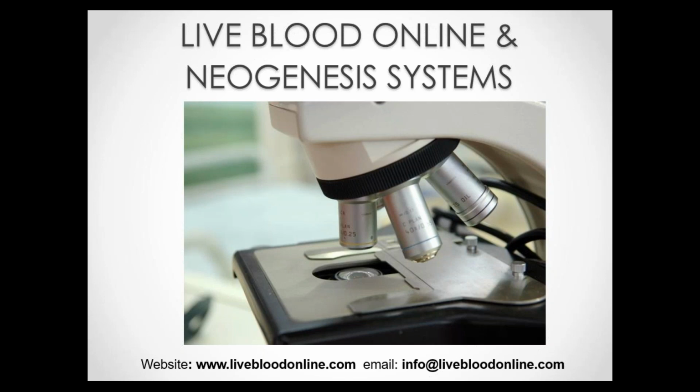Now, I've often seen people who want to add live blood analysis to their practice, but who don't want to invest in a good enough system. So they start with a very basic system that doesn't really allow them to see everything that they should be able to see, and they never really then fully benefit from live blood analysis. So, in summary, the theory, the practical proficiency, and the correct equipment are all very crucial to get started.